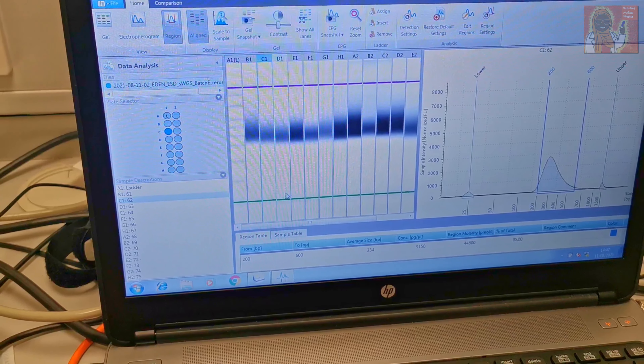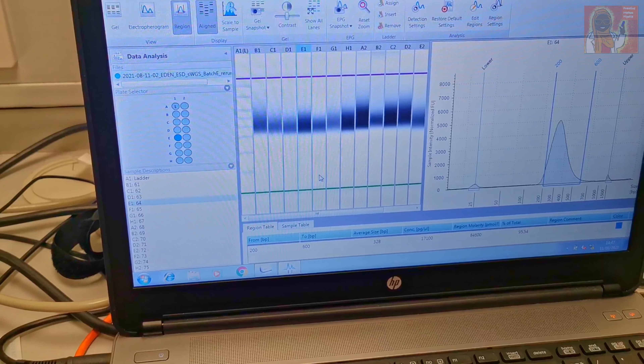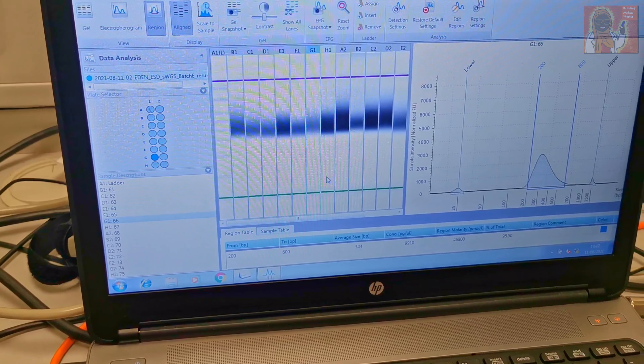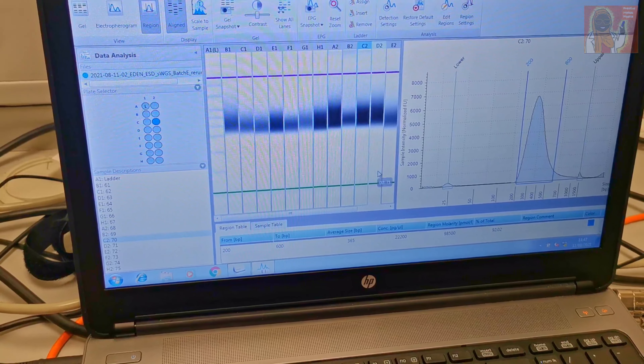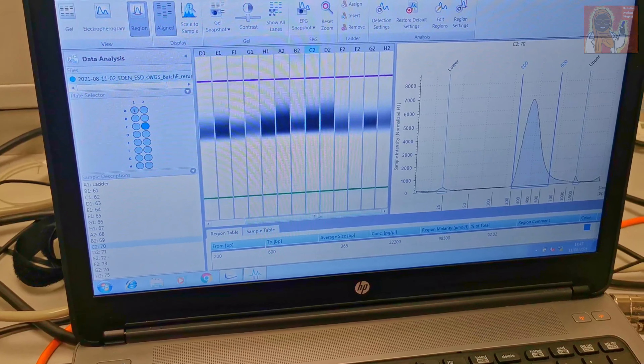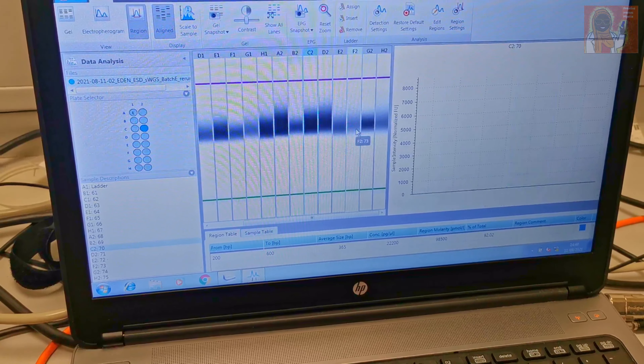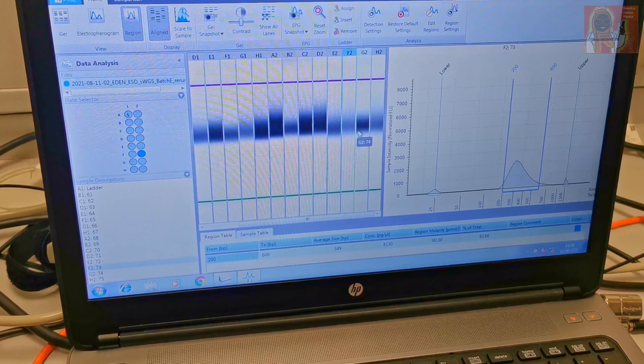I'm back at the TapeStation room looking at the data — it looks quite good, just what I would expect. The primer dimer contamination is non-existent for these samples, which is a relief. Now I just have to export the data as usual and then I'll head home.